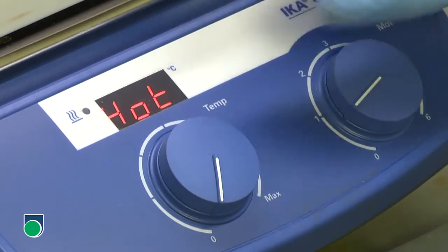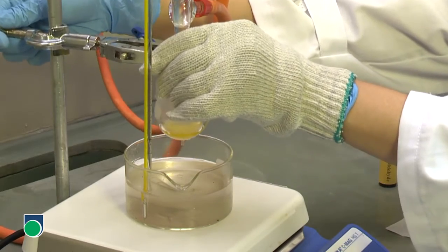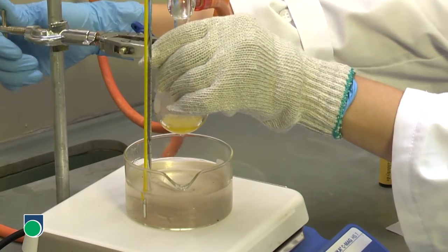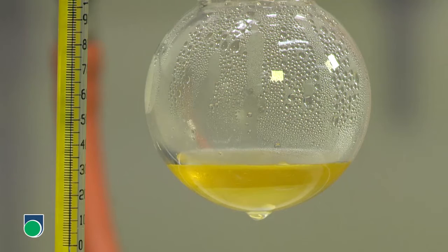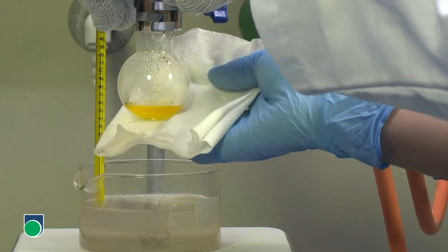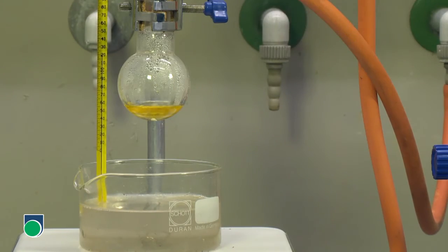When the reflux has finished, turn off the heater. Cool down the reaction mixture to room temperature. Use a piece of tissue to remove the droplets of oil that stick on the bottom of the flask.